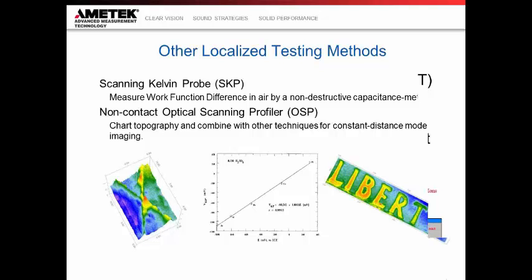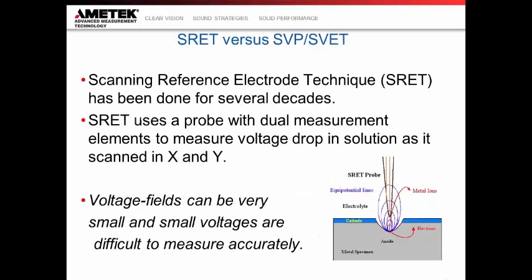So I'm a trained electrochemist, and as such, with the idea of SVET, it benefited me to know really where it came from. It really benefited me to understand how that technique evolved to how we do it today.